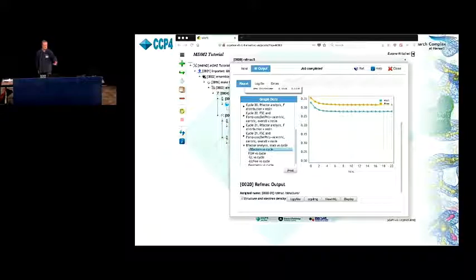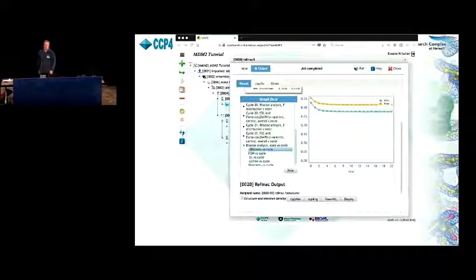Each node in this tree is a job. If you click that node, you get an output report for that job with some nice graphs and reports. And there are several buttons to display the output data produced by the job.